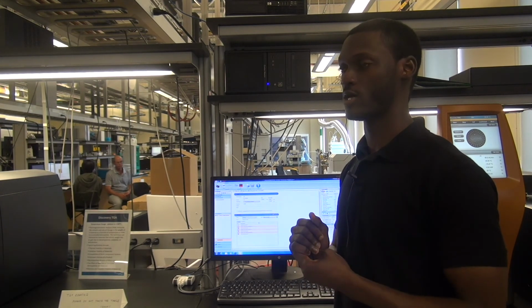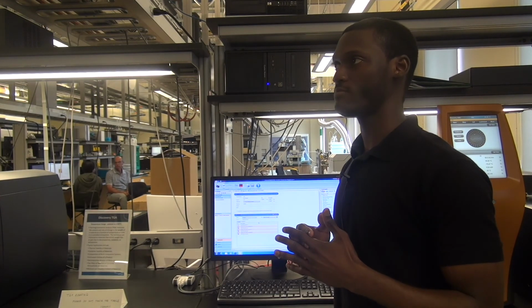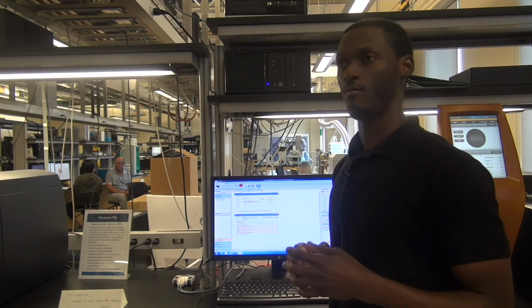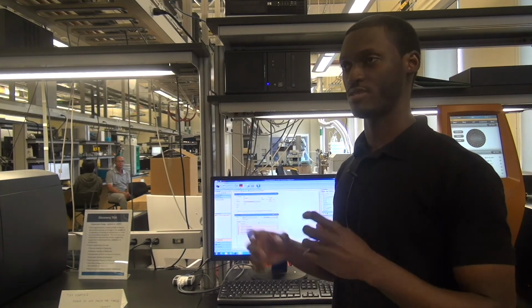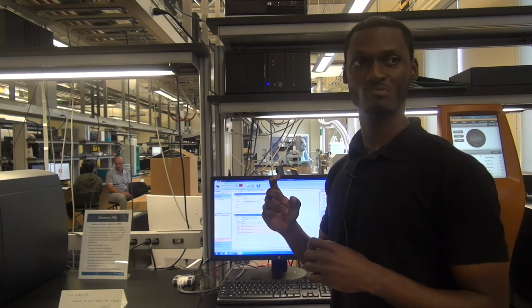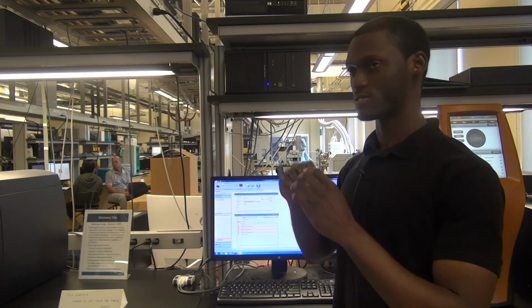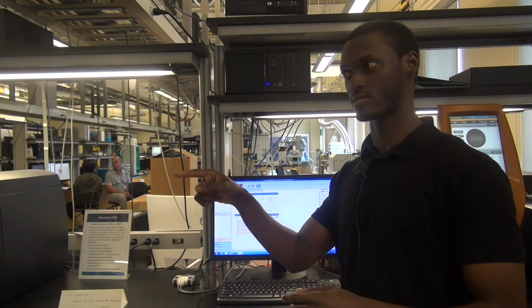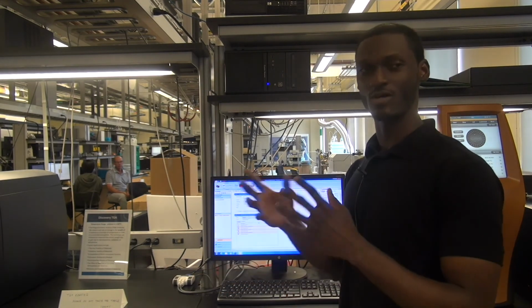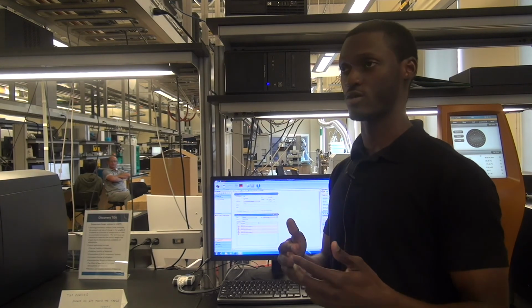Okay, not necessarily because the transition itself is shifted per se, but the sample itself takes a longer time to get to that temperature because you're heating it so quickly. Okay, so by the time the furnace, for example, is at 200 degrees, your sample is only at 150. So it's now going through the transition, but you look at your raw data, it's going to say it's going to happen at 200 degrees. So it's a sort of a confusing thing to look at when you start changing your heating rate.